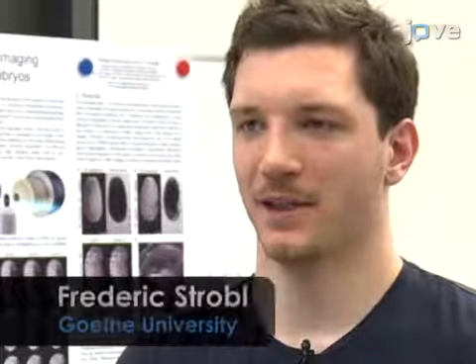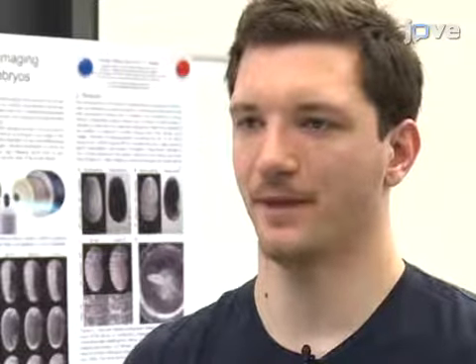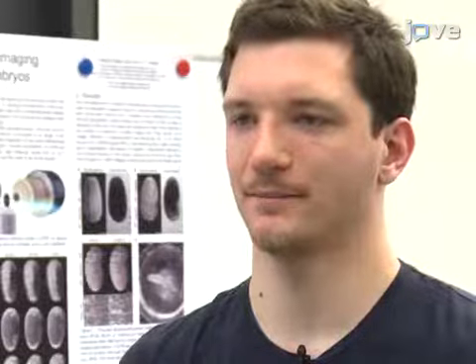Light sheet-based fluorescence microscopy helps to answer morphogenesis-related questions in the emerging insect model organism Tribolium castaneum, addressing cell migration and proliferation patterns from the early blastoderm to the onset of muscular movement. The main advantage of this method is that critical factors such as photobleaching and phototoxicity are kept to a minimum even when the embryos are observed for several days.